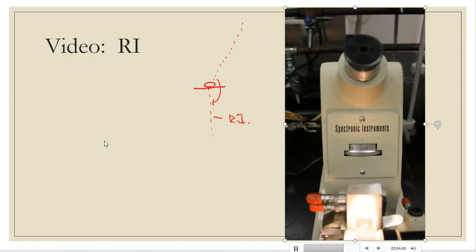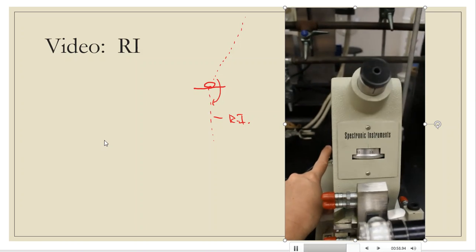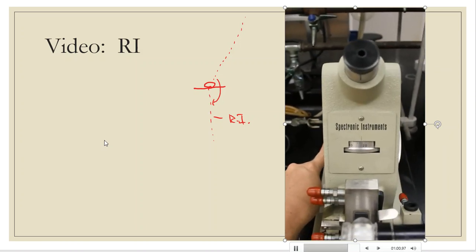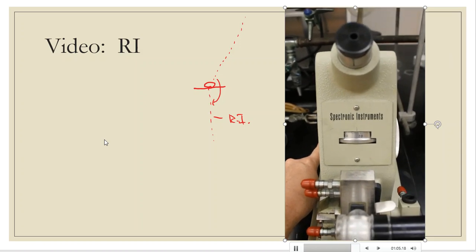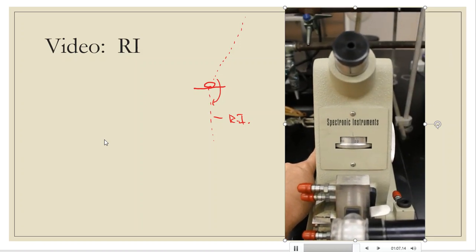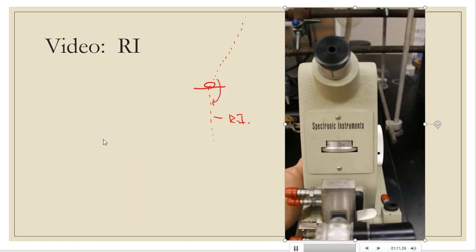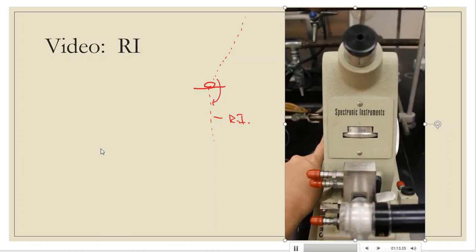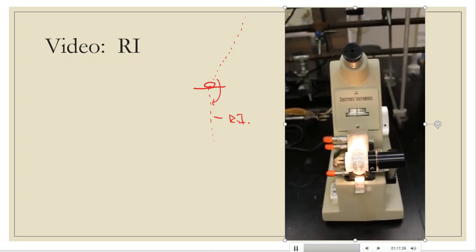When I line it up the proper way, I'll go back to my flip switch, I'll push down, and then a meter will show up in the top. Once the meter shows up, I'll read the number that is displayed, and then I'll move on to my next cut. Folks, I've got probably 15 cuts here plus a pot sample, so I'll be at this refractometer quite a while.